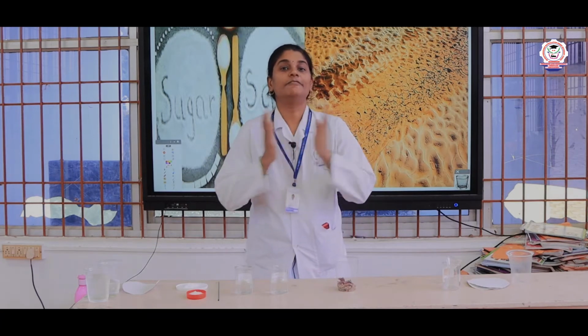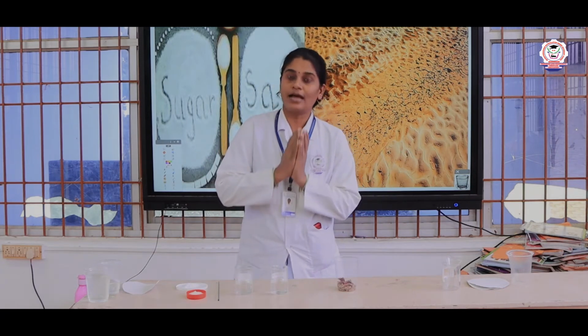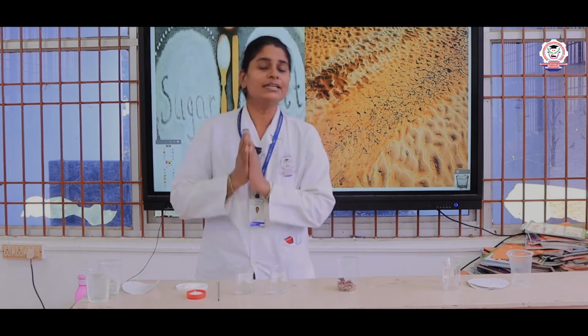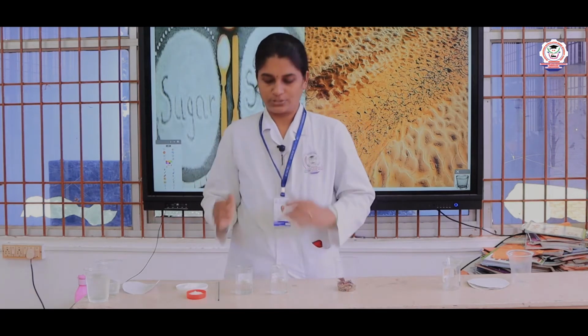Today we are going to see the different types of impurities. What are impurities? The substances that make the water unfit for use. These substances are called impurities. As we discussed earlier, there are two types of impurities: soluble impurities and insoluble impurities. Today in this session we are going to see practically what the soluble impurities and the insoluble impurities are. Come on, let us do the practicals.